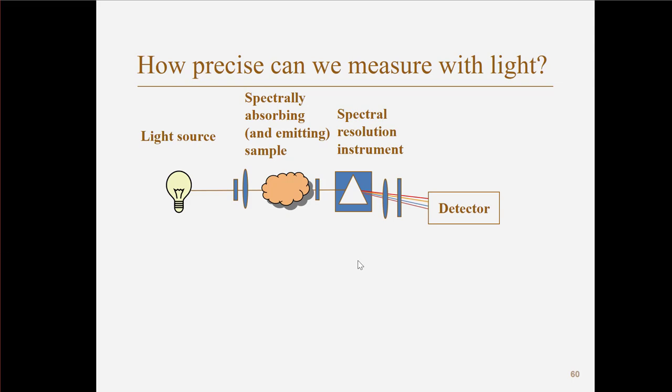We have previously looked at this setup, but now for simplicity, let's just look at one signal channel. We'll ignore the other channels and have a single detector. Of course, you can look at the same noise properties in many detectors, but for simplicity, let's do this.